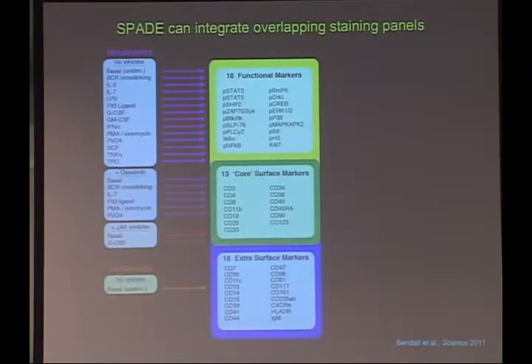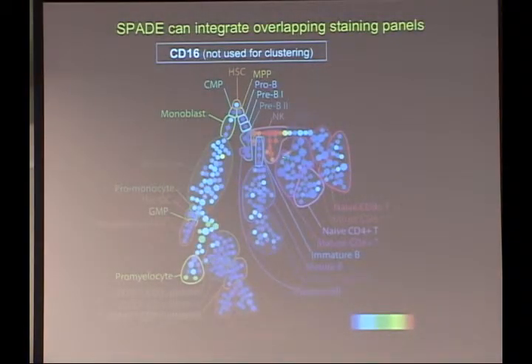And this is a very nice, quick, intuitive way to come up with a tree structure that makes some sense and then get lots of complementary information from these other markers. These were very, very helpful, actually, in picking out all those different immunological subsets that we use to label the tree. If we didn't have the information from these markers, I don't think we could have put quite as many labels on that tree. Just as an example, we didn't have a proper NK marker in our data set.